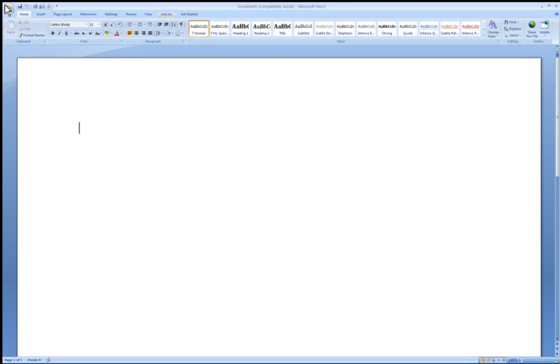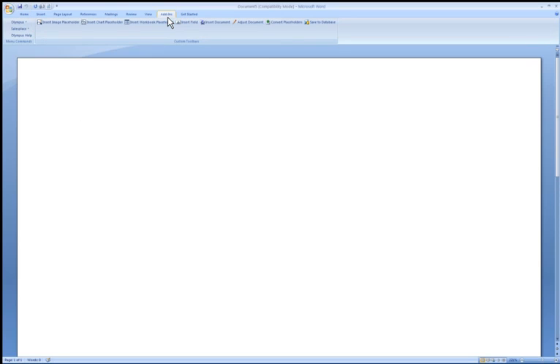I will now show you how to create a new page template to use within Stream. Start with a blank document in Word. You will need to select the add-ins tab. You can select the type of placeholders you would like in your new page template.